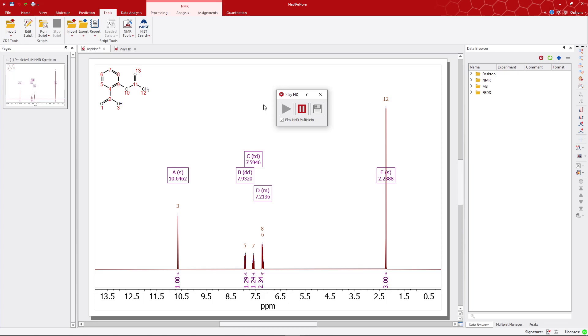For instance, multiplets in the aromatic region will produce a higher pitch compared to those in the aliphatic region, enabling an auditory differentiation of the chemical environments.